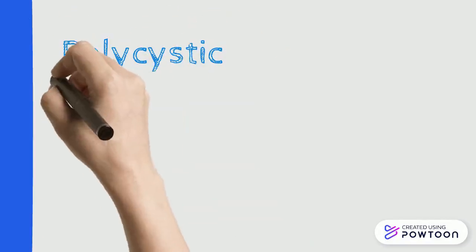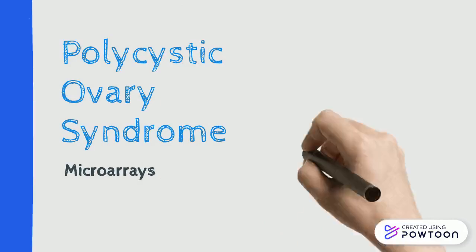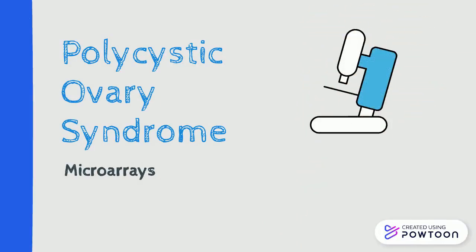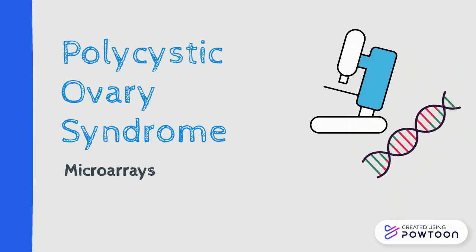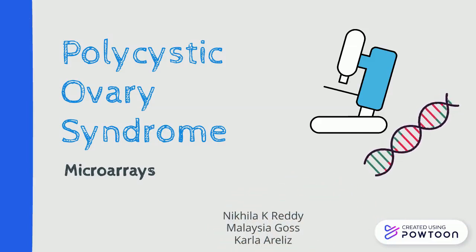Hello. In this video, we'll be explaining the biotechnology technique of microarrays and how it has been used to better understand and possibly treat polycystic ovary syndrome, or PCOS. We'll explore the molecular mechanisms of microarrays, the kind of data they generate, and how they compare to other techniques. We will also go over an example of their use in PCOS research.